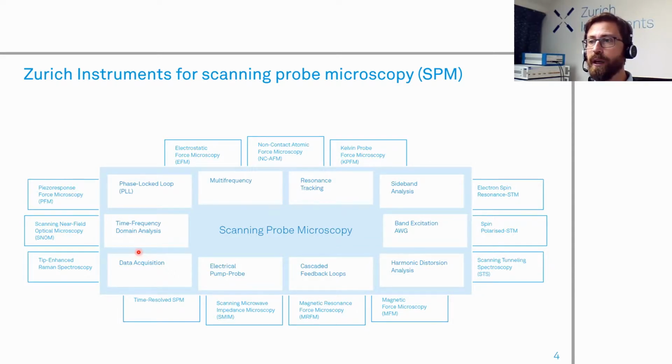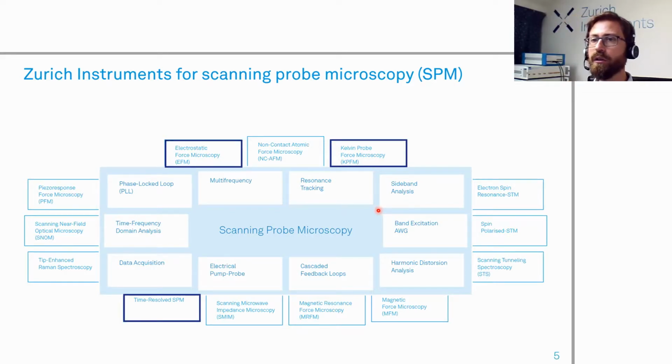Inside this blue square are the various tools and functionalities that are often essential in controlling the SPM setup and that are included in Zurich instrument product. For the purpose of this webinar, we will focus essentially on electric mode, so EFM, KPFM, and of course time resolved SPM. That will be a nice way to illustrate this multi-frequency lock-in technique, sideband analysis. Of course, we'll go through PID loops and data analysis in time, frequency, and acquisition. And at the end, we will have this electrical pump probe method shown by Mehdi.